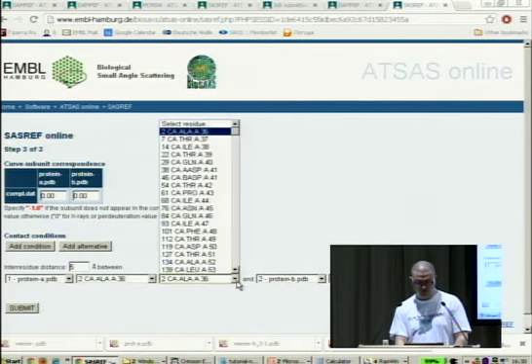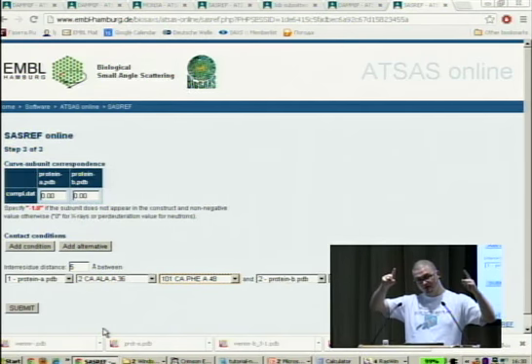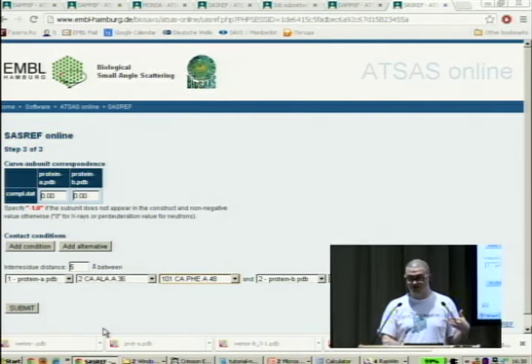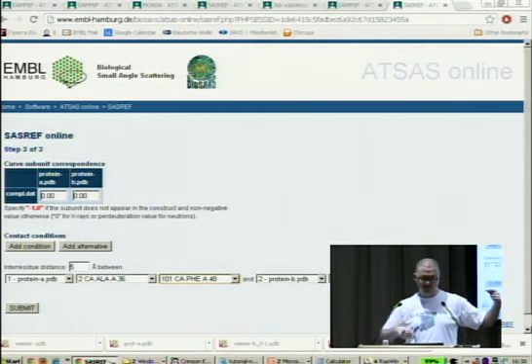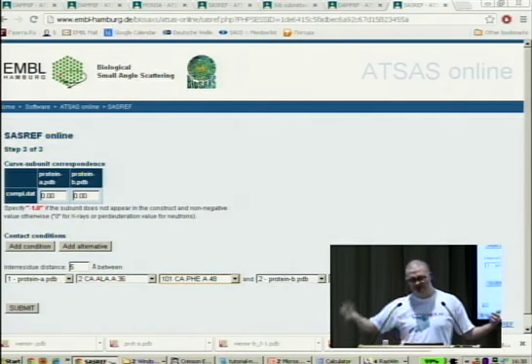But we can say that from the first residue till this residue, and the program will take any residue in between, whichever is at the correct distance to the residue mentioned here. So you can add ranges, and if one of the residues in this range would be at this distance to another residue in the other range, then the penalty would be 0. And like this will be considered done.